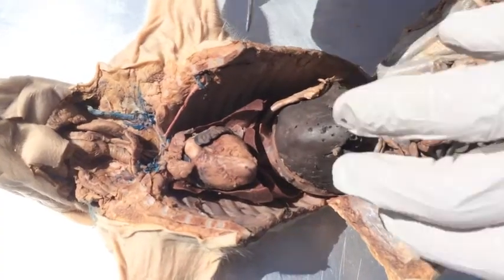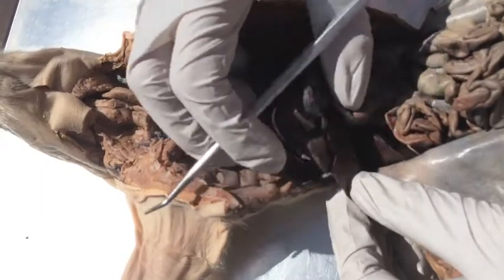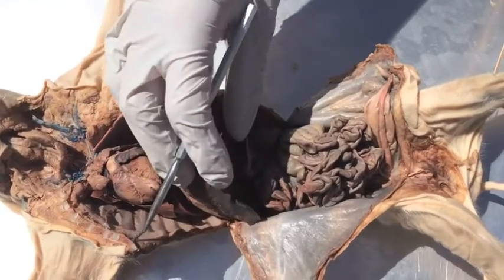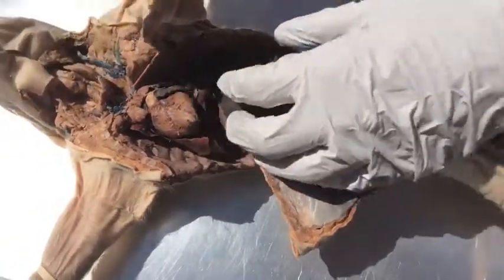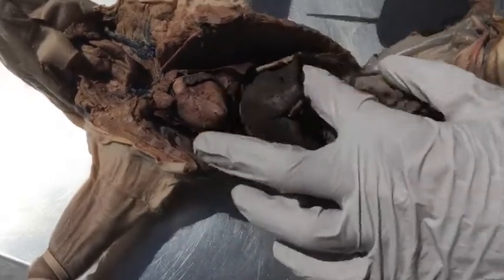Then we have the gallbladder, which is located right here, this little pouch underneath, and it functions to store bile. And then we have the pancreas, which regulates blood glucose levels and hormones. The pancreas is located right here.